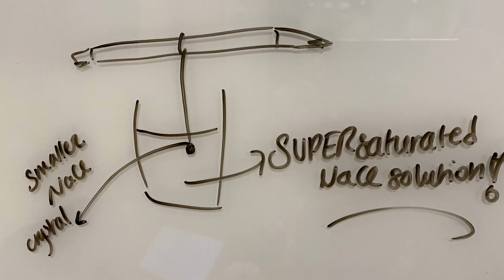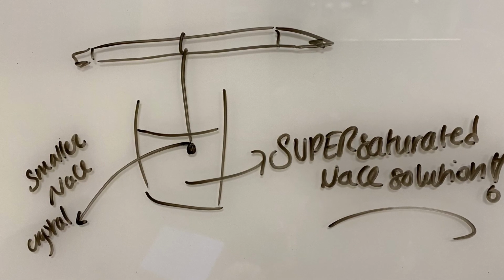This can be done more effectively in a cooler setting with less lighting in order for the process not to be disturbed.